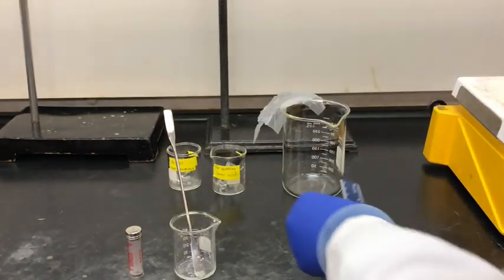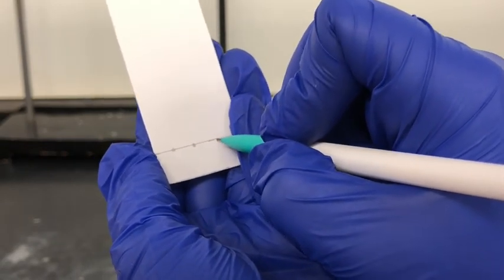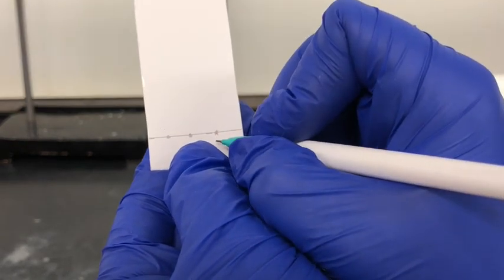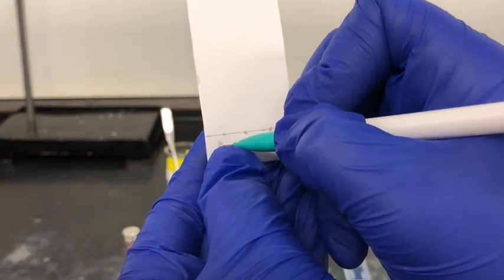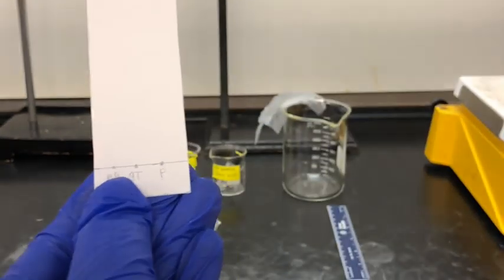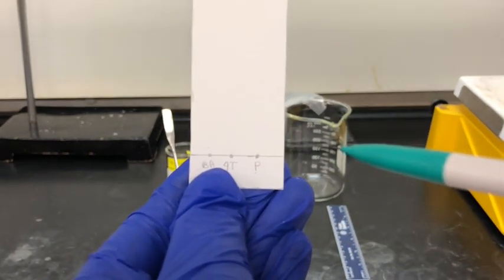When drawing these lines you want to use pencil and be very gentle or you can chip the silica. Now I'm going to draw three dots with my pencil: two will be for each of the reactants and the last one for our product. I'll label the last dot 'P' for product, the first dot 'BA' for benzyl azide, and the middle dot '4T' for 4-tolylacetylene. We're comparing the product to our two reactants to make sure we don't have any reactants left in the product — this is one way to track a reaction.